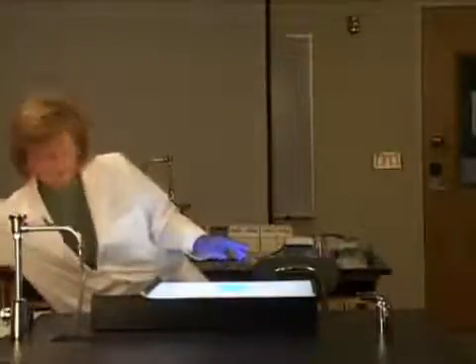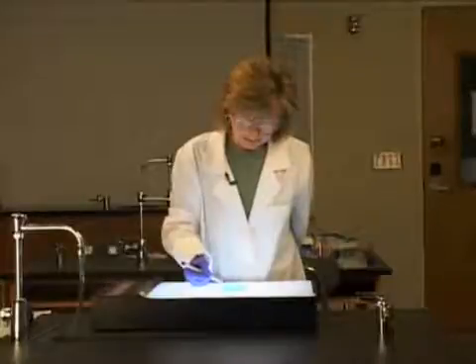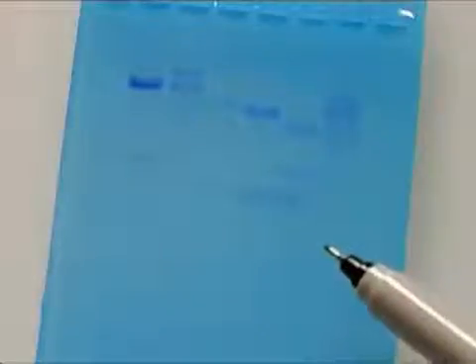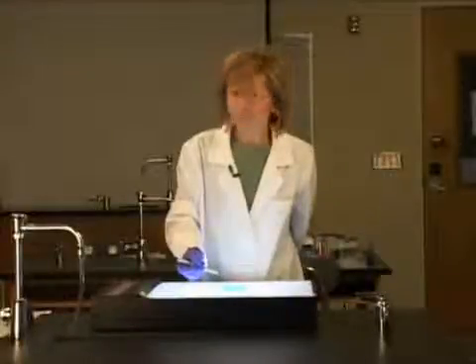And you can see here was our DNA ladder, the standards of known sizes. And look at the banding patterns that we have with these different enzymes, the banding patterns of DNA. So we can now tell the unknown sizes of DNA by comparing to the standards. And this is very helpful to have, very important information to help characterize any novel DNA that we may be examining.